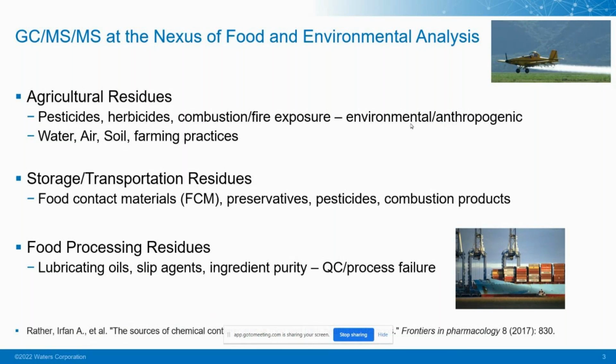We'd find it being studied as an agricultural residue after application, often to a food crop, and be looking at, as an environmental analysis, the effects on plants and animals, as well as small organisms in that environment, along with transformation products of the pesticides. So the analyte list grows and grows.